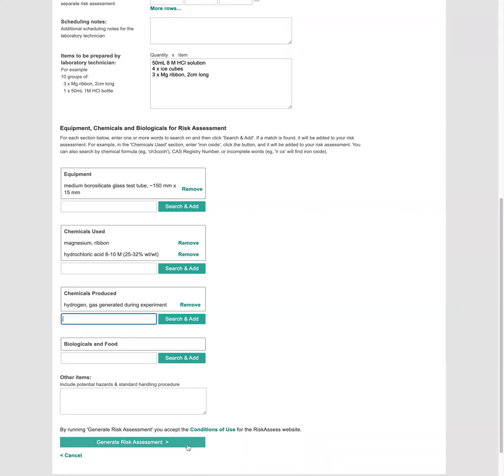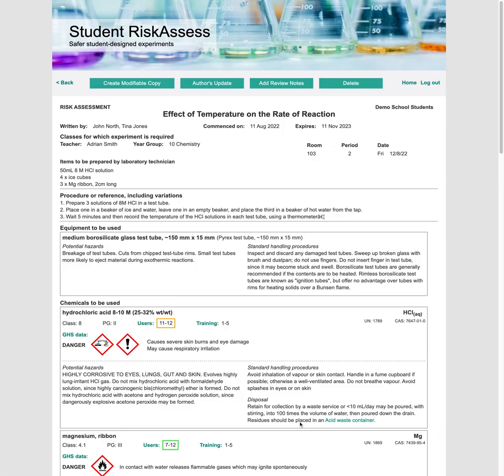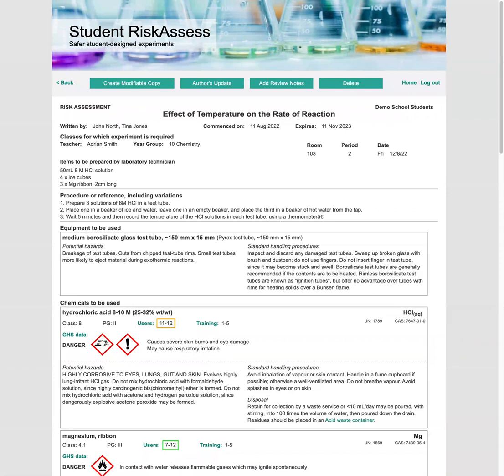So let's go ahead and generate the risk assessment. Now we could go ahead and assess the risk now. But let's say that we're out of time and we need to log out and come back again later. So let's click the log out at the top.